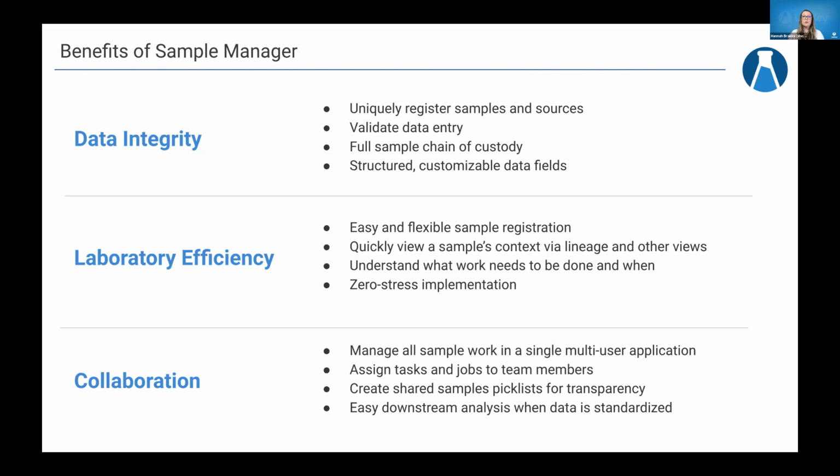And then of course, that full sample chain of custody. So you'll be able to see what has happened with a sample in our timeline view throughout its life within the application. And that really makes for easy auditing, easy troubleshooting, easy reporting, and then structured customizable data fields. So what I'm going to show you later on, what other folks are going to talk about, again, we've allowed for this structure, but also customization that gives your lab what you need. Laboratory efficiency.